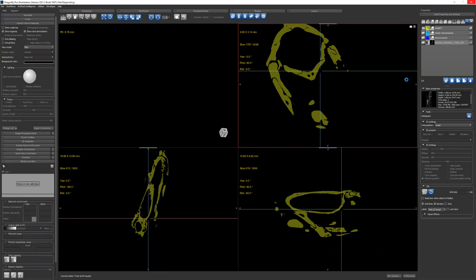You never edit, because we're going to edit this volume. You never edit your original volume, because you might need it down the road. You're not destroying your raw data, because you have that somewhere else. But if you need it down the road in this project, and you have edited it, you can't undo that.